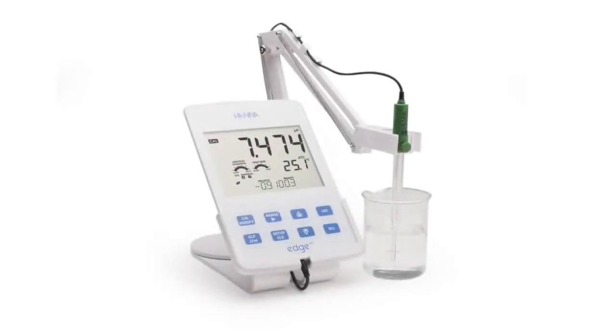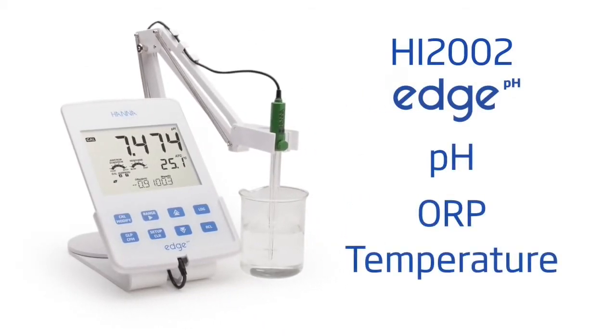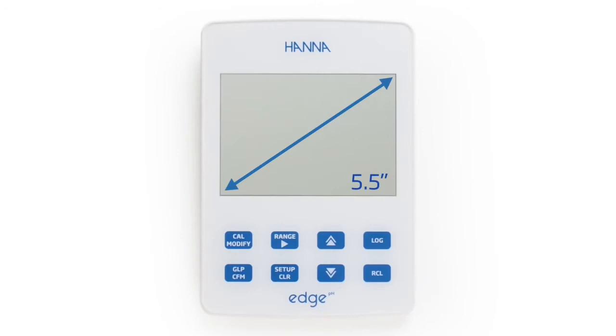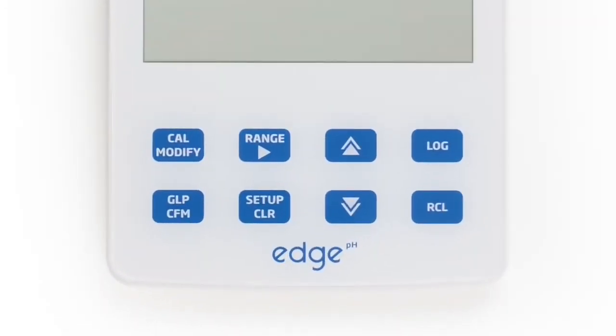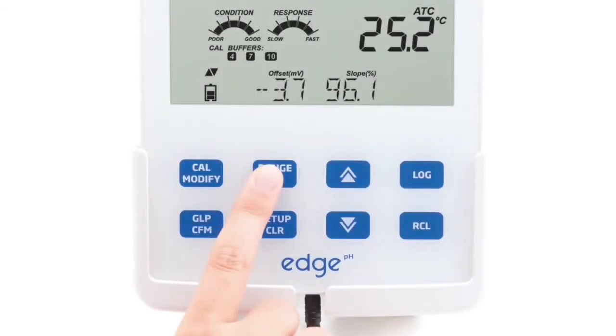The HI2002 is part of Hanna Instruments' line of single-parameter edge meters and is specifically designed for the measurement of pH, ORP, and temperature. This meter features a large 5.5 inch LCD display and dedicated keys for basic meter operations. It incorporates capacitive touch buttons which are clog resistant and easy to clean.